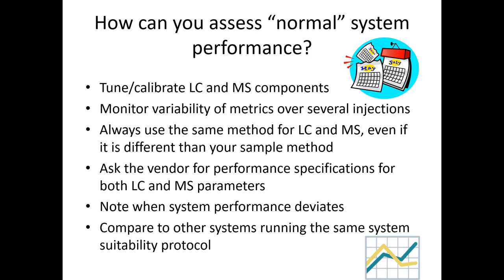I happen to work for a vendor. I have a system suitability protocol I use, but in order for it to be out there in the public with application notes and stuff, it is a significant amount of work and legal crud. So when I talk to a customer that has a triple quad in their lab, I'll give them a method and I'll say, this is the sample I use. So ask your vendor, ask your salesperson, say, I need a system suitability, get me in touch with someone who can give me some details.